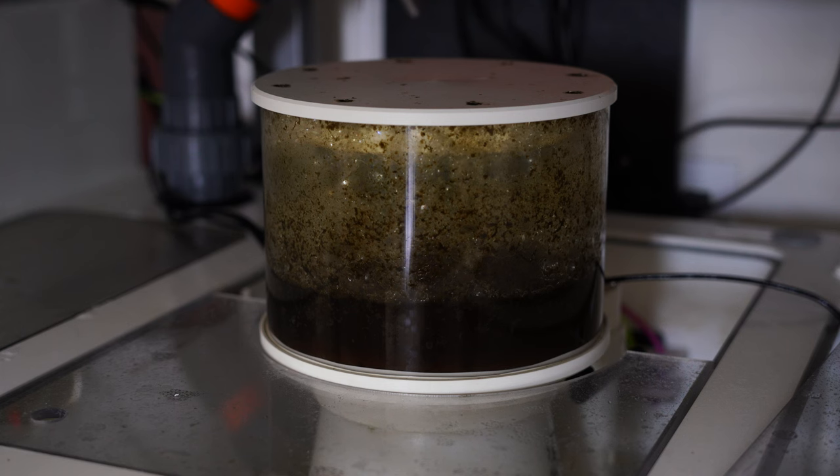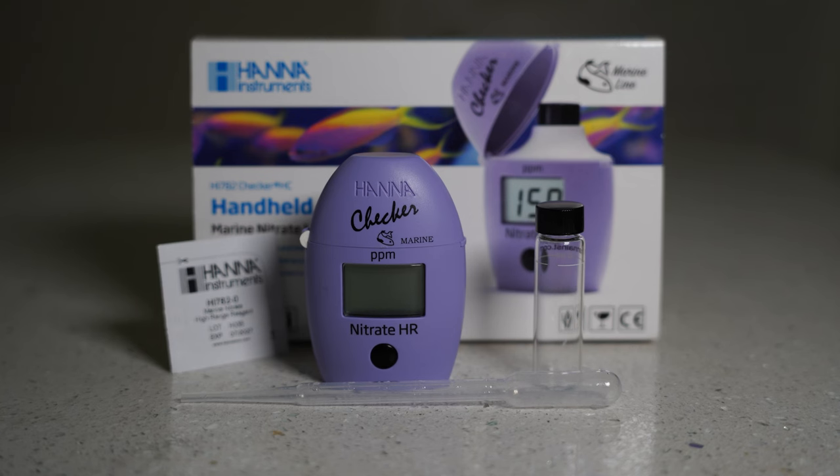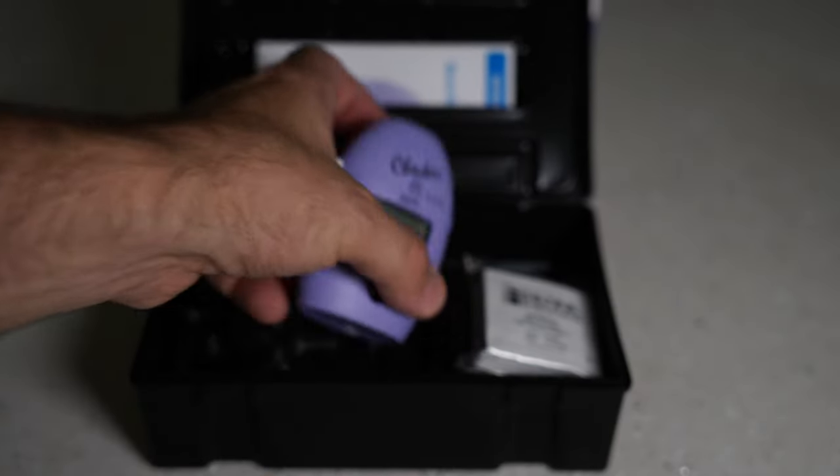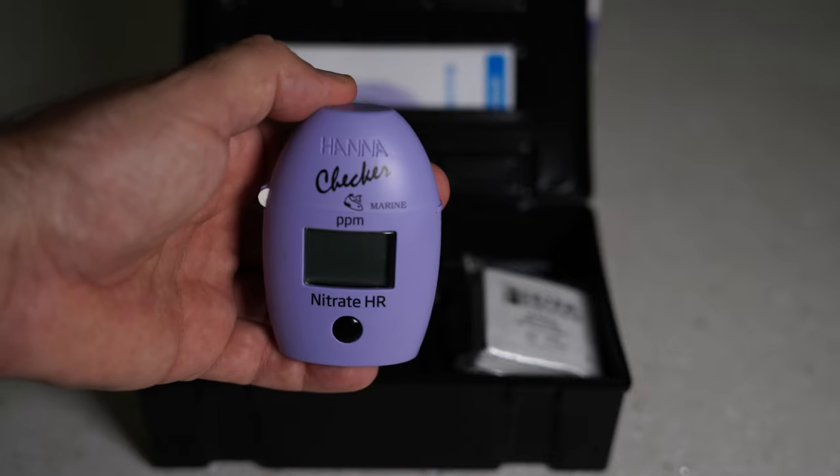Next up is nitrate and phosphate — they kind of go hand in hand. Nitrates occur as organic waste breaks down. In the past, people have said to shoot for zero nitrates and zero phosphates because we consider these variables as water pollution and that's why you want to keep them low. But we have found that you need some of these for corals to survive, so don't keep them at zero. For nitrates, we're gonna use the Hanna Checker and I'm looking for a number that's less than 20 ppm.